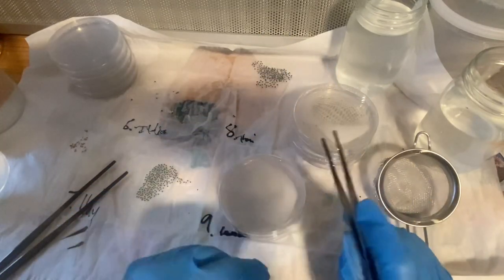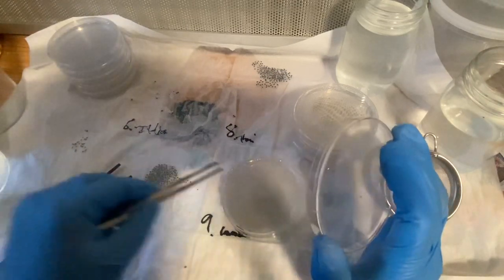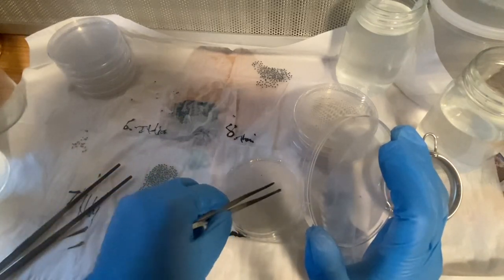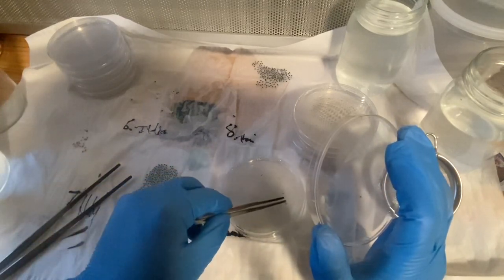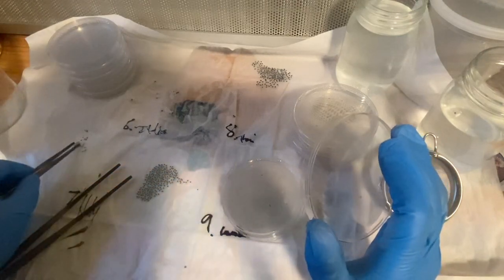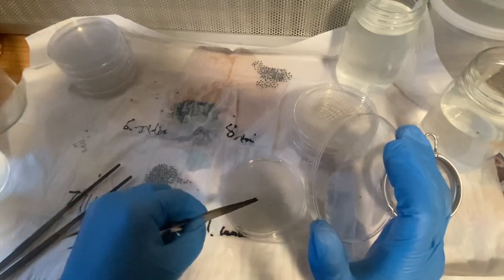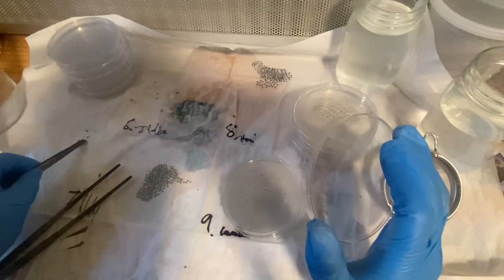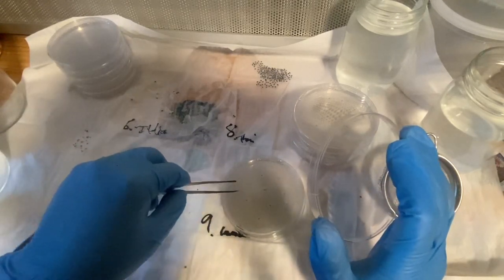Make sure you label those, but I'm going to go ahead and do that after I'm on camera. But I'm just spacing these out, and then I'm going to tape them with micropore tape. I'll show you what that looks like here in a second. Right when I finish up these lavenders, I'm gonna go ahead and tape them up. And then we're done. And then, like I said, you can put them in the dark for a couple days and then move them into a light cycle.